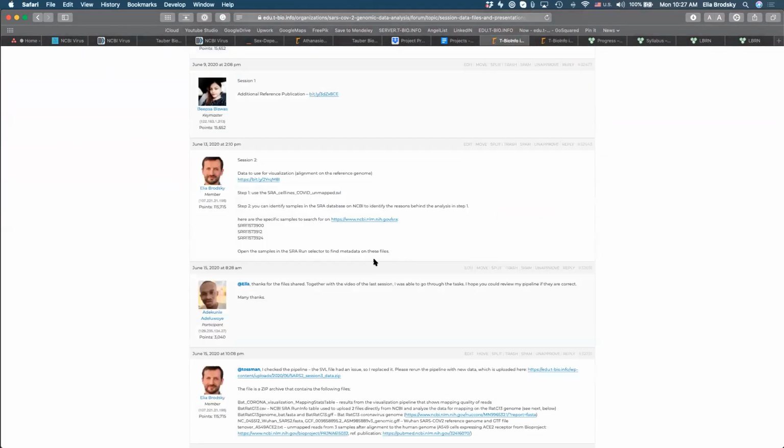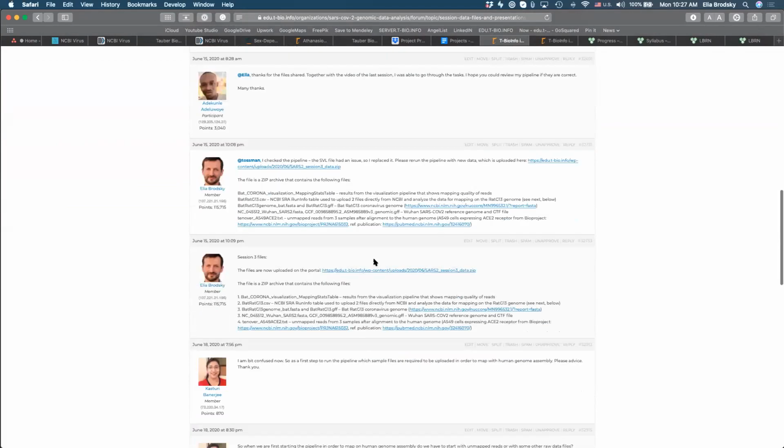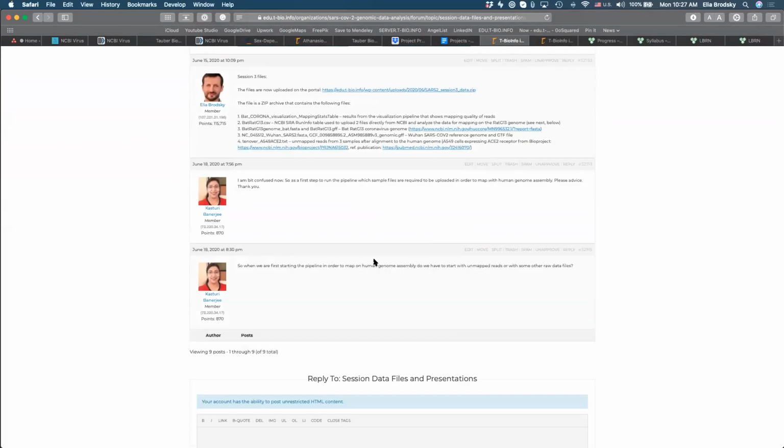Okay, so here you can see some of those links posted. So you download right here all of the data, right? And then you have some of the data sets inside. Okay, so let's first of all talk about session 3 files, right? So how do you actually download these files and what's inside these files for those of you that got a little bit confused by this?